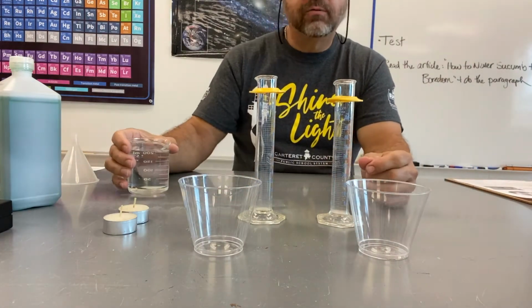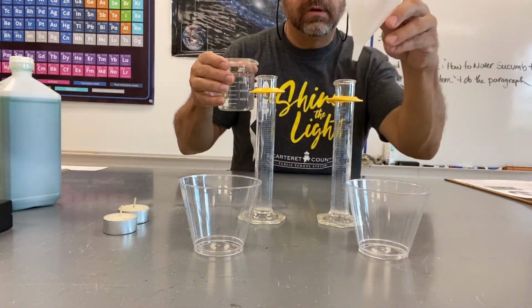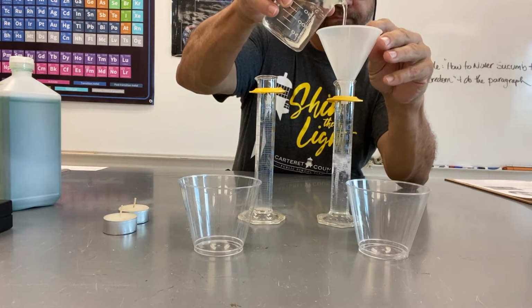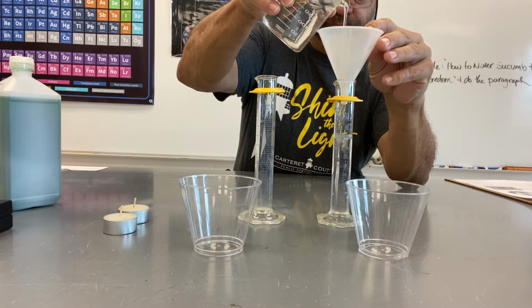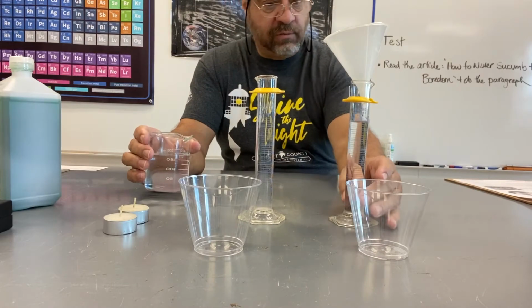So I'm going to start off with my water. I want 50 milliliters. Use a funnel here and try not to make a horrendous mess. Turn it to face me for a second so I can see if I'm on that mark or not.